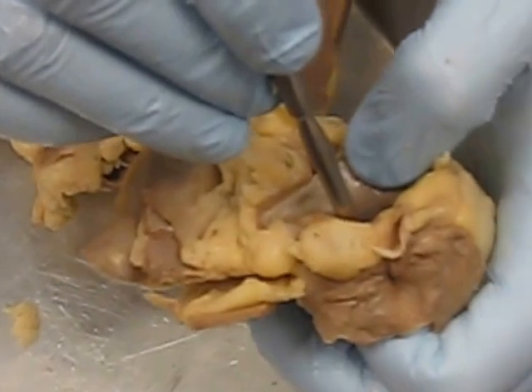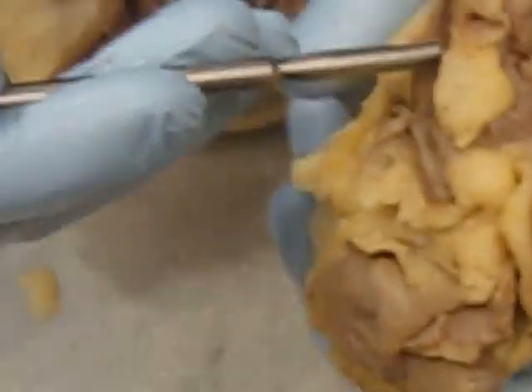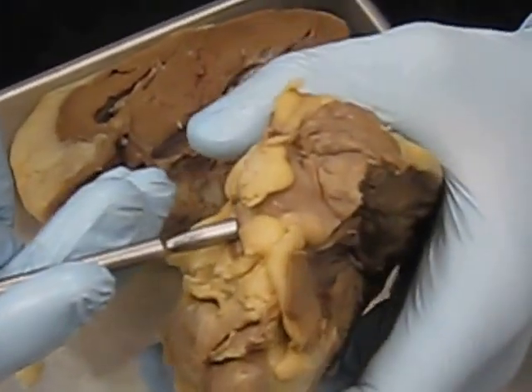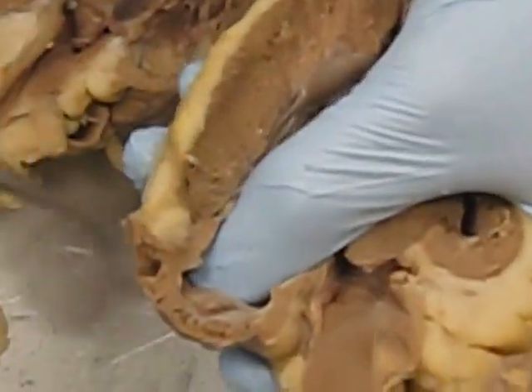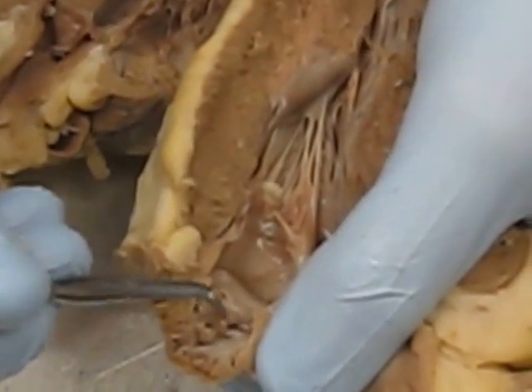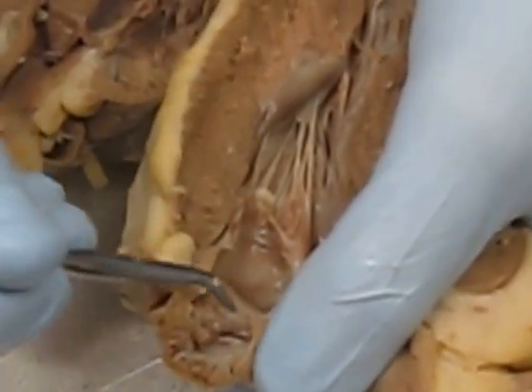The pulmonary vein goes right in here and drains into the left atrium — the left chamber up here. Inside we can see the network of muscles mentioned earlier called the pectinate muscles, which are the network of muscles inside the atria.